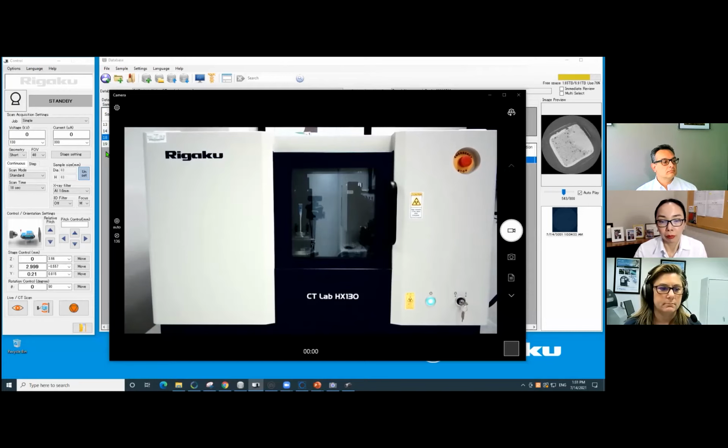And all of them are things to consider, but especially when you're doing time resolved measurements, let's think about what would be most important. Okay, I think most of you voted, so let me end the polling and let's take a look at the results. Okay, so know the time scale for sample change is most important. And you all got exactly the correct answer.